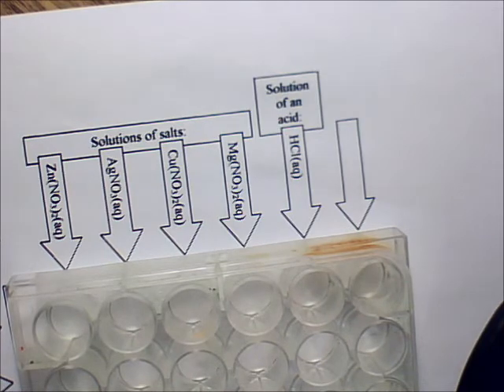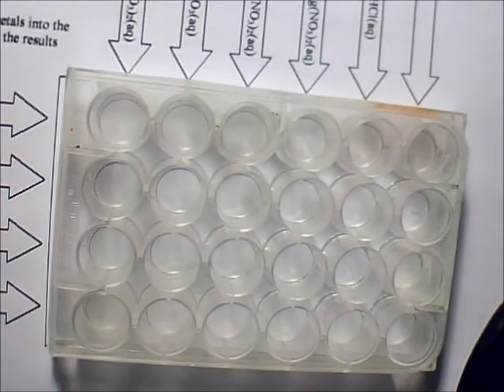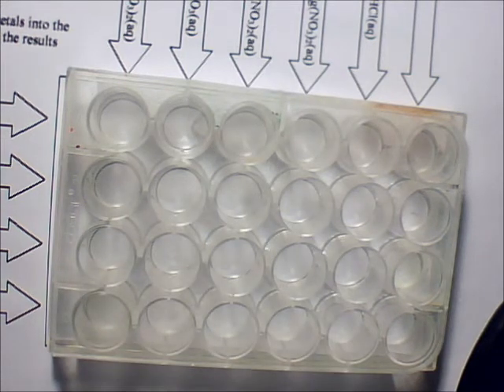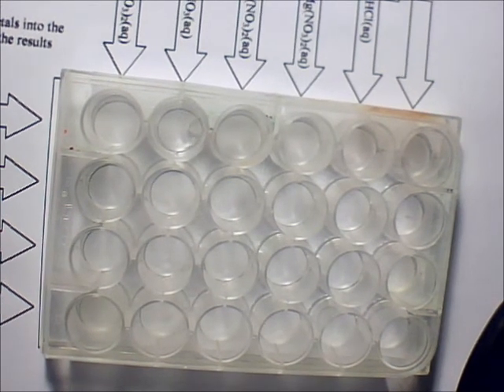Fair enough? All right, now, whenever you run your reaction, you only need enough liquid to just barely cover whatever your metal is, okay? We don't want to waste material if we don't have to. We're going to be good stewards of the environment and not use more material than we have to.